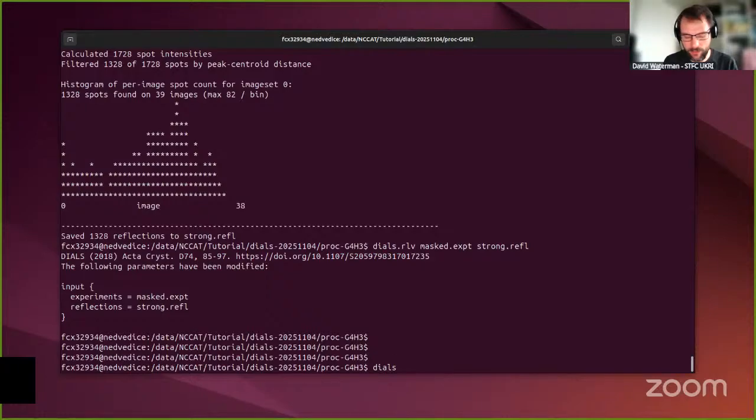I won't upset the axis completely and show the rotation axis program working on that. But to save a bit of time, I will just run the program on the file that we have at the moment, just to get the plot out really.